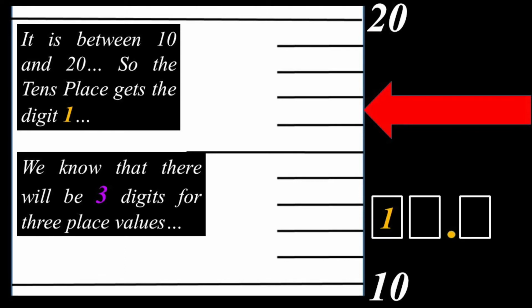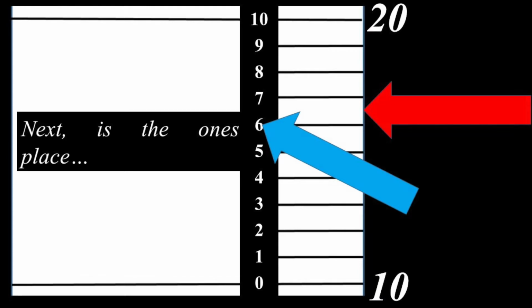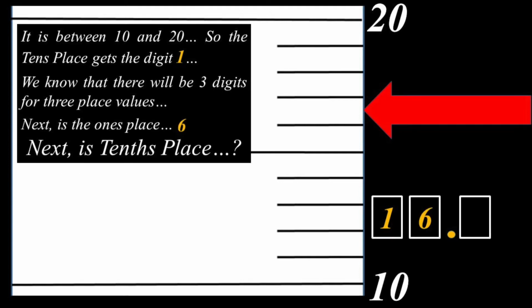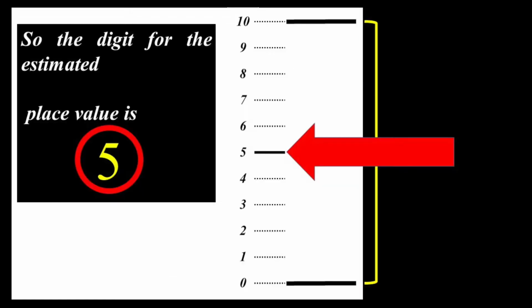However, the method that I use here should be learned, because when you have a measurement that's a little bit more confusing, you just simply use these very basic techniques to find any measurement. It's foolproof. All right, so that's where the sixth comes from. Okay, the sixth is from the sixth graduation. That's ones place. Okay, and then it's going to be between 6 and 7.